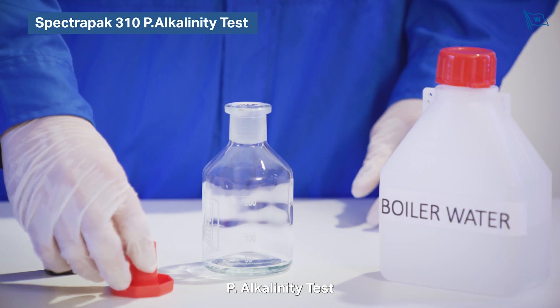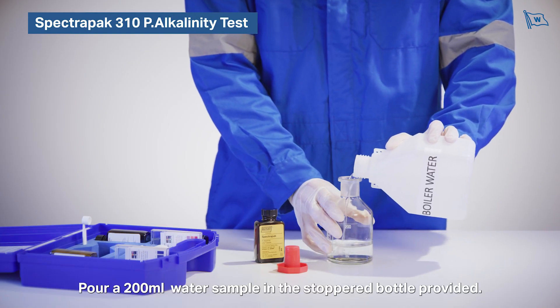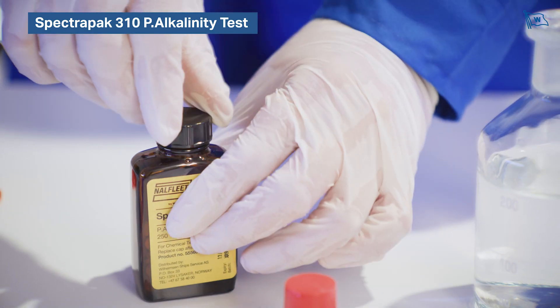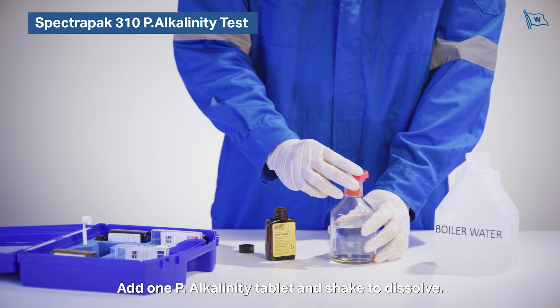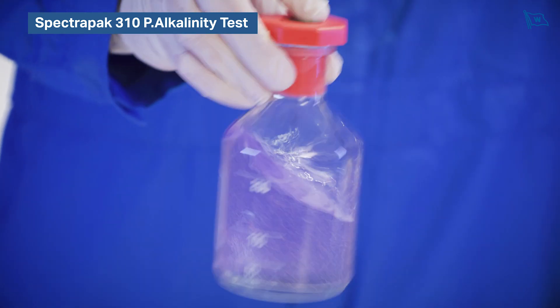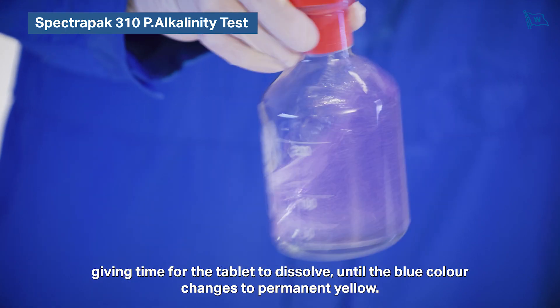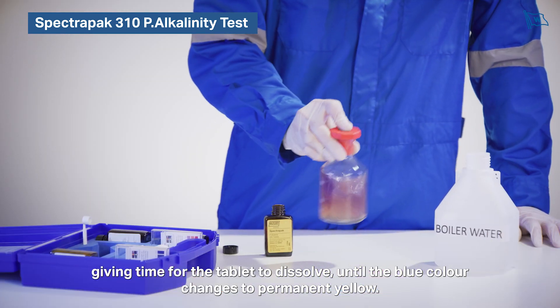P-alkalinity test. Pour a 200 milliliter water sample in the stoppered bottle provided. Add one P-alkalinity tablet and shake to dissolve. If P-alkalinity is present, the sample will turn blue. Repeat tablet addition one at a time, giving time for the tablet to dissolve, until the blue colour changes to permanent yellow.